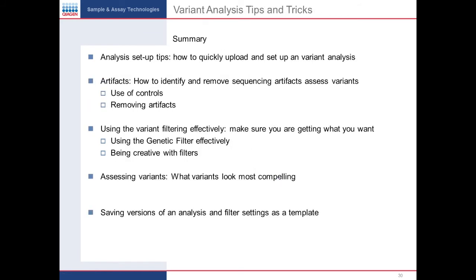All right, so boy, I took almost an hour. I didn't realize it was going to take that long to go through all that, but hopefully a bunch of that stuff was helpful for you. We talked about how to get started, how to set things up quickly, how to manage samples. I know sometimes that can be a bear when you don't have folders to stick things in, but annotation is key. We talked about how to deal with artifacts. That's a biggie.